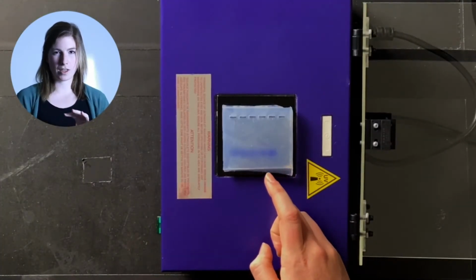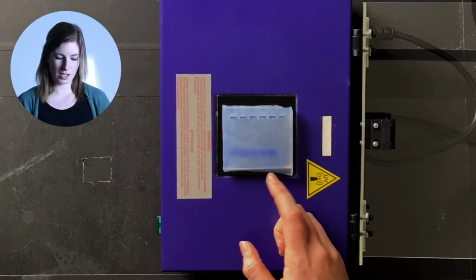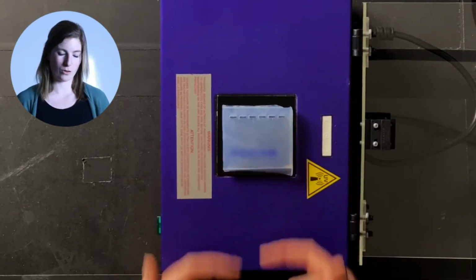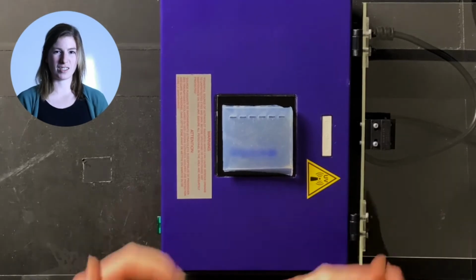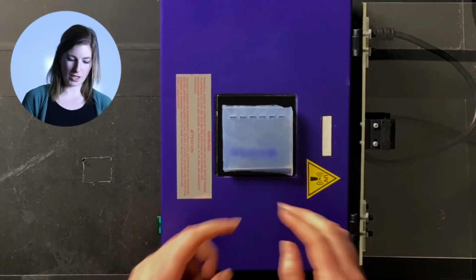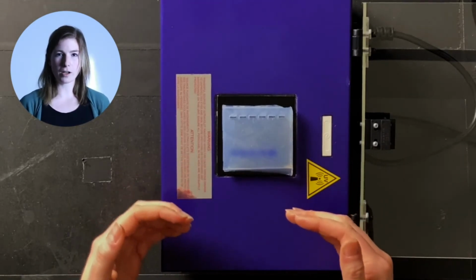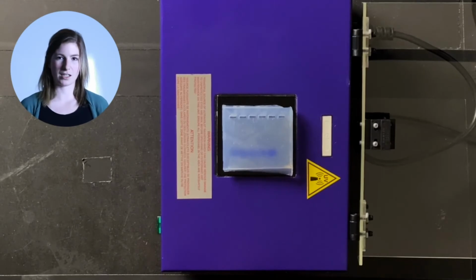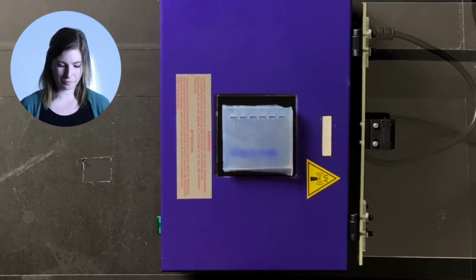The most important thing when you're doing a gel electrophoresis is to make sure that those purple bands don't run off your gel, right? That they don't go away, because that means some of your sample may be gone, might have gone off of your gel. So I stopped it before it got too far, but I let it run a decent amount so that the bands that were different sizes could at least separate from each other.